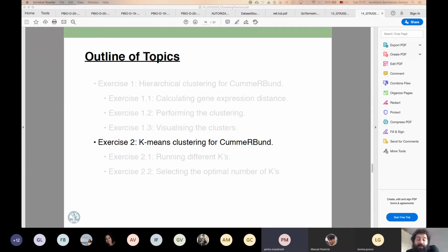It's a warning. Basically, what it's telling us is that it doesn't know what summary function you are asking for, so it's going to use min. And as I said, I wasn't able to trace the problem to run this with no error. So I just keep it with summary because it still gives us the thing that we wanted.